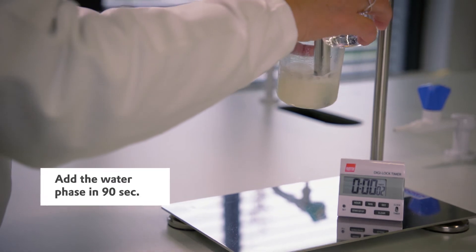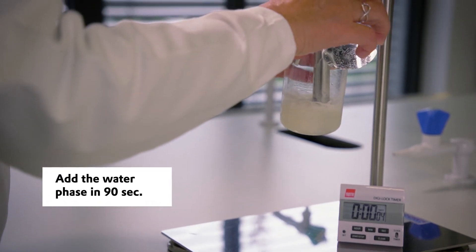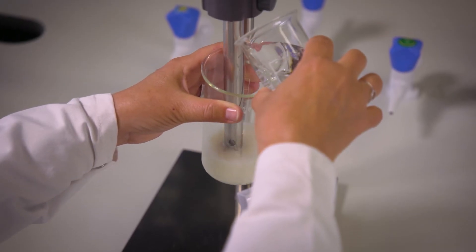In the second step, you add slowly the water phase to the oil phase on the stirring and homogenize everything with an Ultra-Turrax.